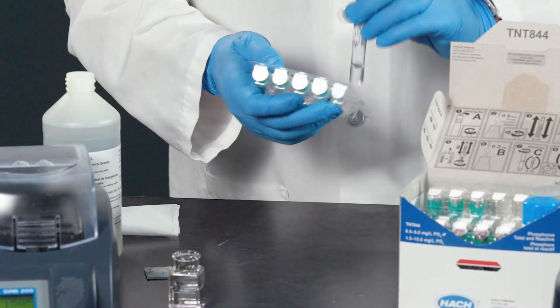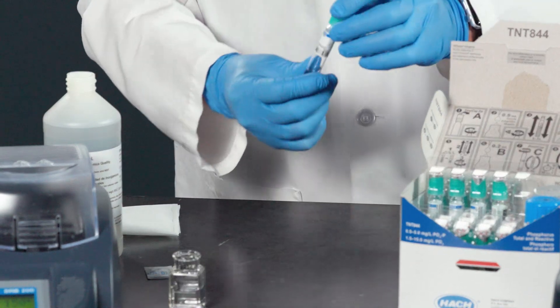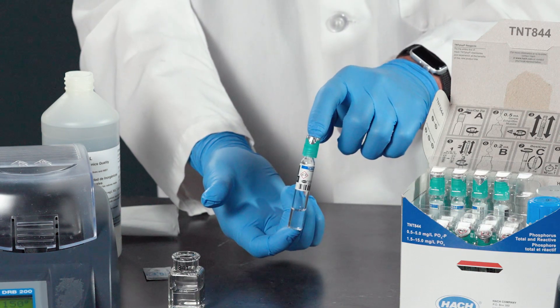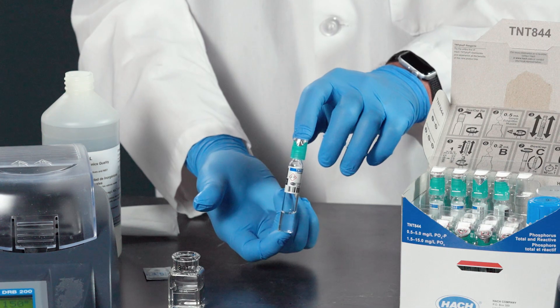How the TNT Plus works — what is very unique — is that within this vial you can do both total phosphorus, or just measure phosphate: reactive phosphate or orthophosphate.